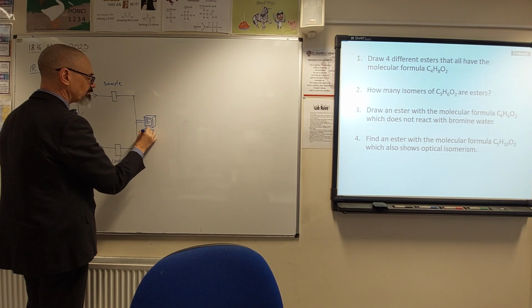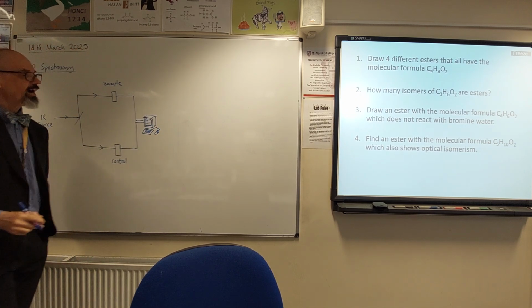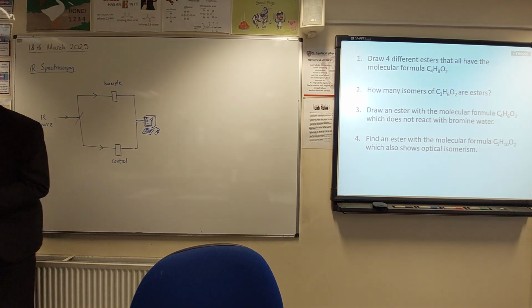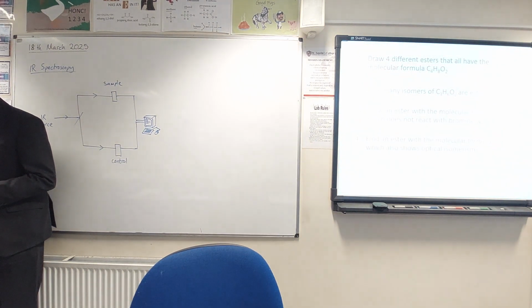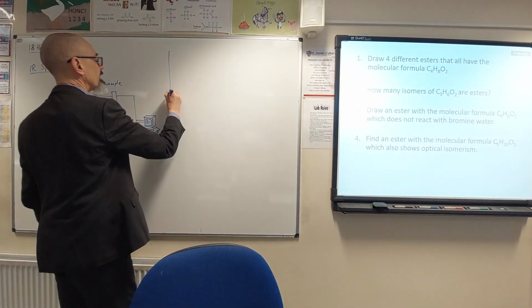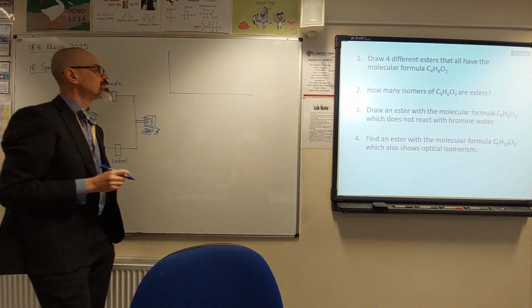Still looks like that in my world. And it gives you a spectrum. What it does is just literally compares the two sets of data, and then we get a spectrum.